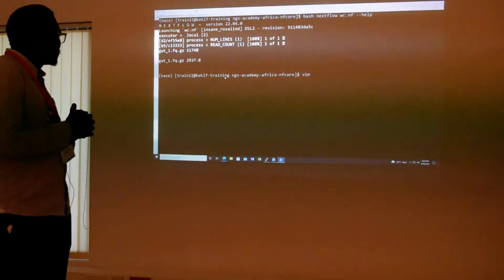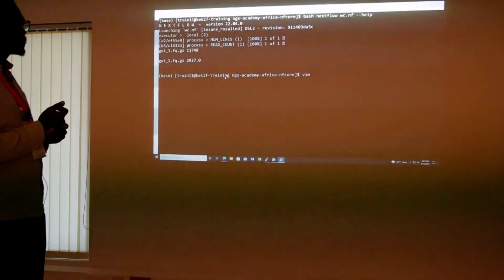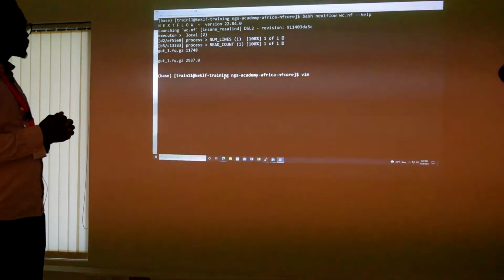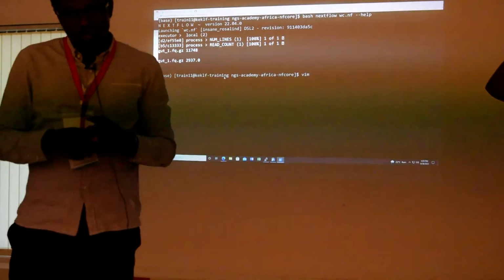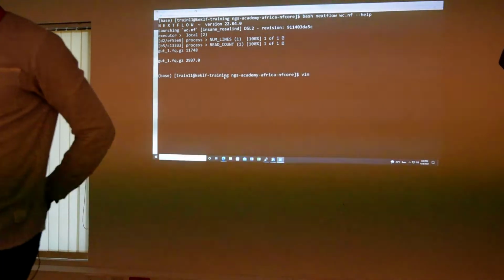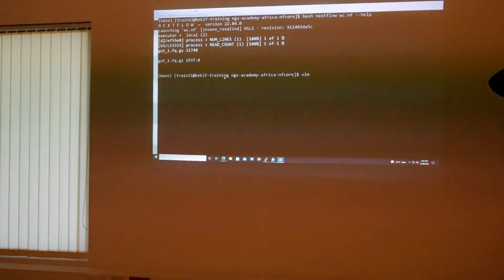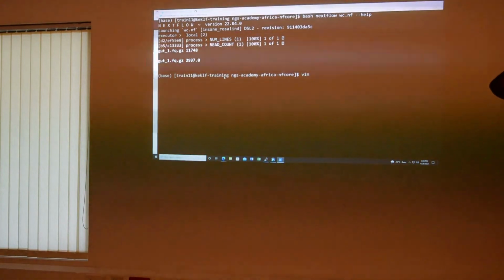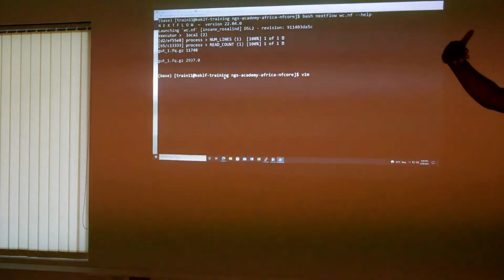So I think we saw the same with Snakemake. If you execute your workflow, you're going through multiple processes, and as Juma said, one of those processes fail. When you restart the workflow in the same directory, it will resume from the point of failure, and that's really important.